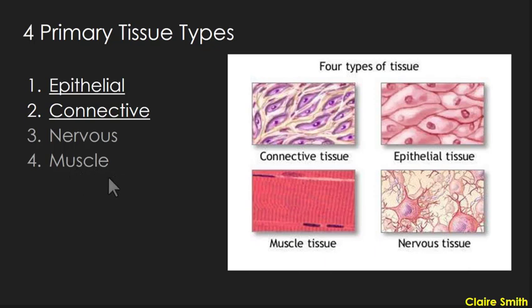All obviously muscle, the function of it is to move stuff, whether it's skeletal muscle, moving your body, cardiac muscle, pumping blood through your heart, or smooth muscle, which is in control of the movement of like food and stuff through your internal organs, right? Digestive system. Think about your stomach churning that food over. That would be smooth muscle. Again, we're going to talk about muscle way more in depth when we get to the muscle section.